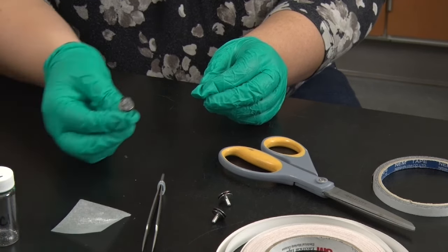Hello, I'm Carrie Donnelly, the director of the Chapel Hill Analytical and Nanofabrication Lab, or CHANL, at UNC. With me today is Catherine McInnes, a graduate student at UNC. In this section, we will show you how to image a sample with scanning electron microscopy, or SEM, and environmental scanning electron microscopy, or ESEM. I prepared our salt sample for imaging, and now I'm ready to look at it with the SEM.